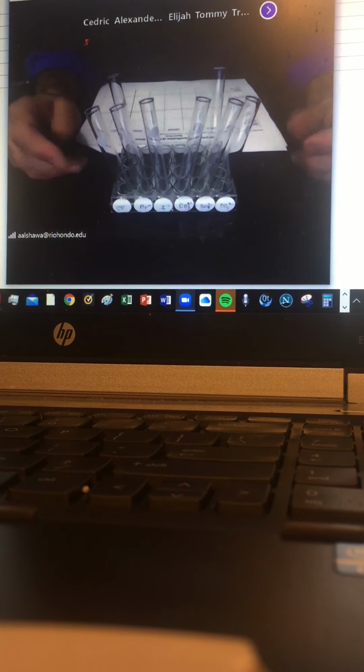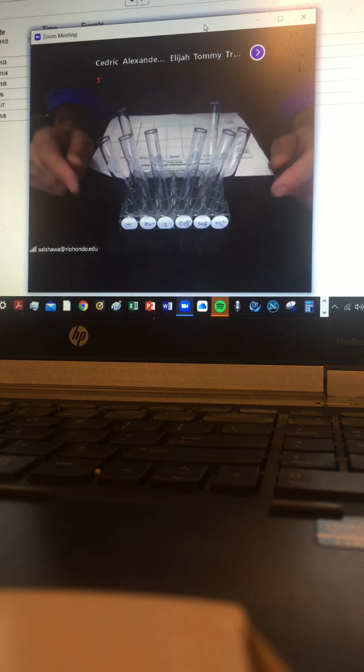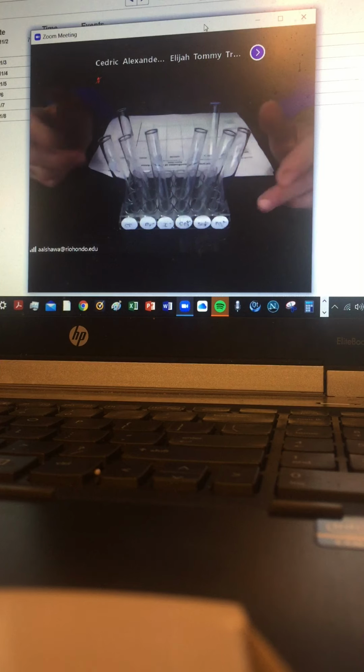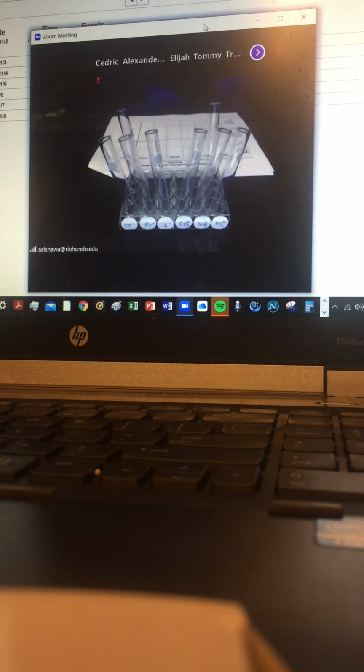We want to simply identify whether or not we have a halide, and if we have a halide, which type: chloride, bromide, or iodide. The same goes for the polyatomic anions: carbonate, sulfate, or phosphate. Let me introduce these ions one at a time.